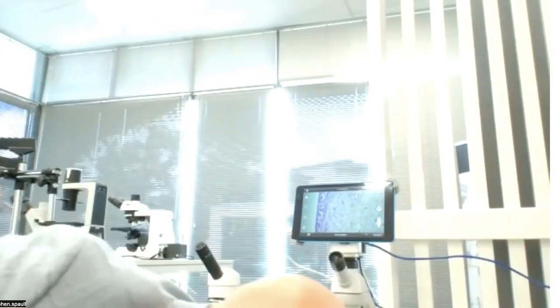You have a range of connectivity with these. You can connect via Wi-Fi, USB, or Ethernet. So what I'm trying to do today is to show you the different types of connections we have. With the cameras, you typically get a box like that.